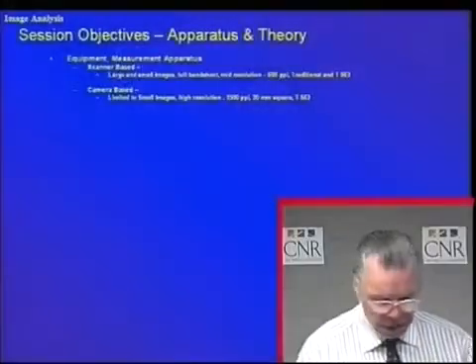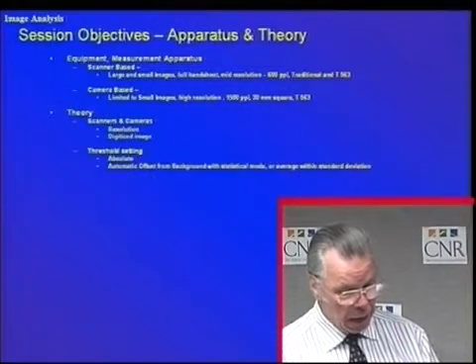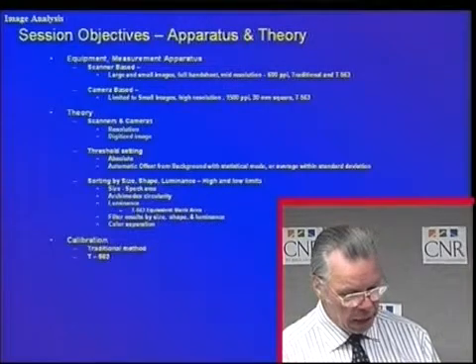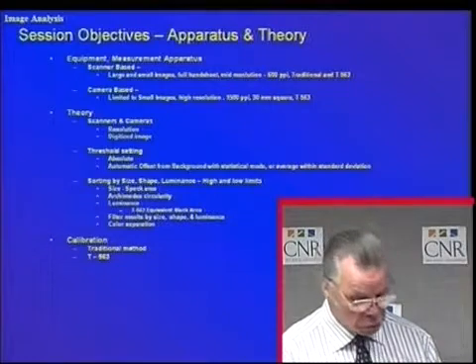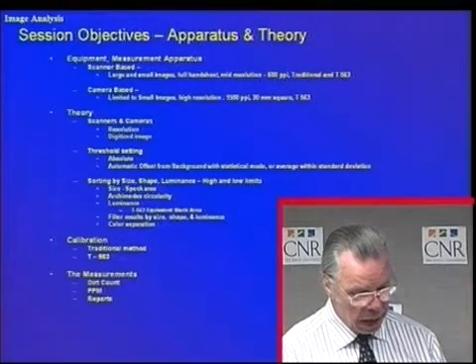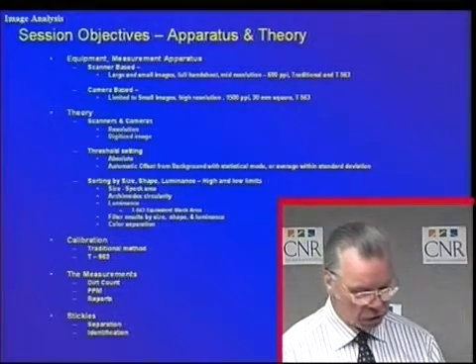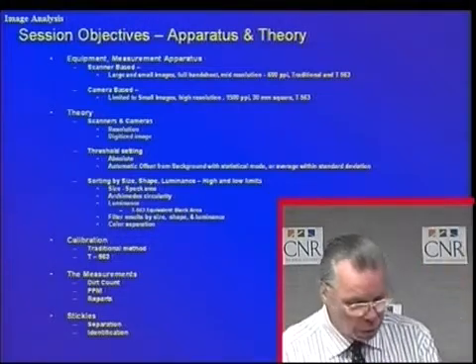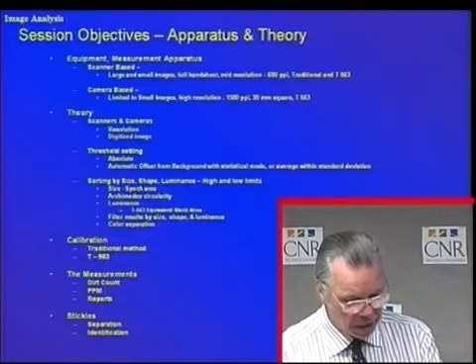What we're going to be doing is covering the equipment, the theory, and how to set thresholds and various elements like this, the calibration of the units using the traditional method or the process control method, and TAPPI 563, and the measurements, the dirt count, ppm reports, and so forth. And then we'll talk a little bit about stickies and how you can quantify the measurement of stickies.